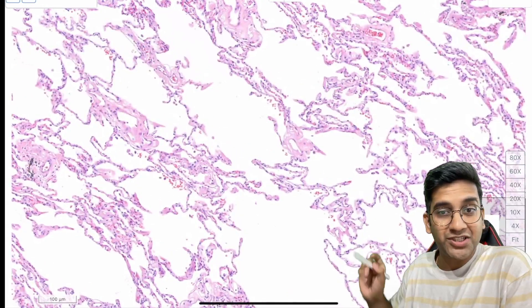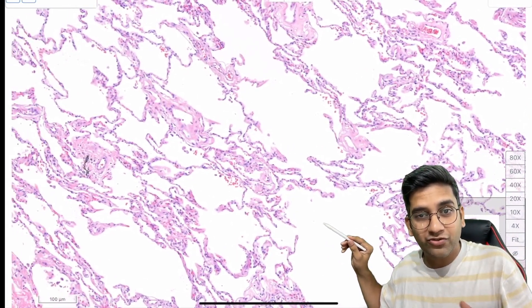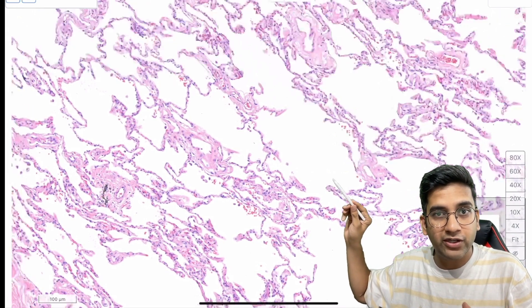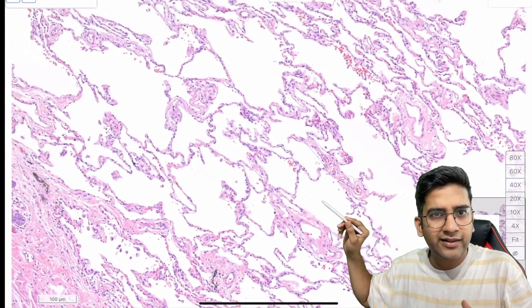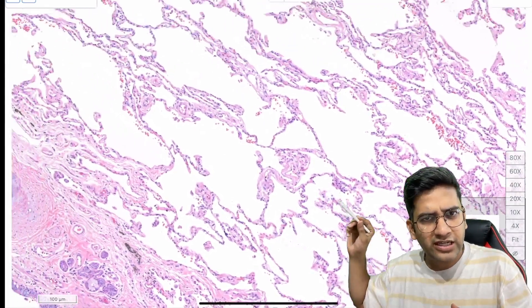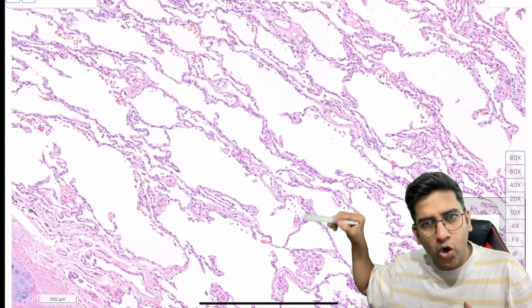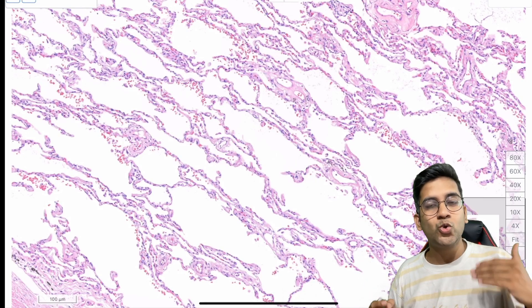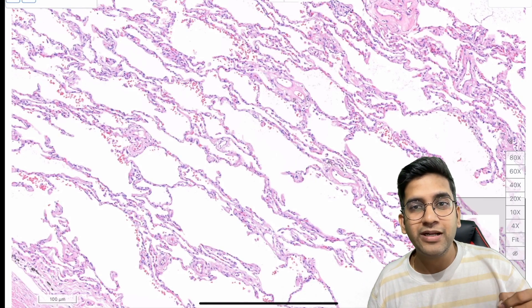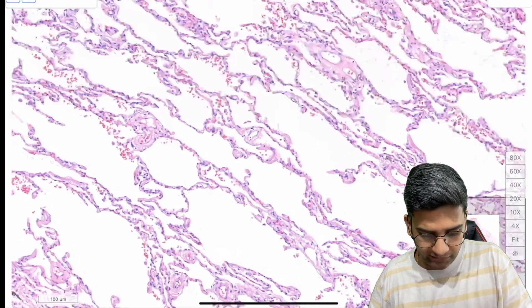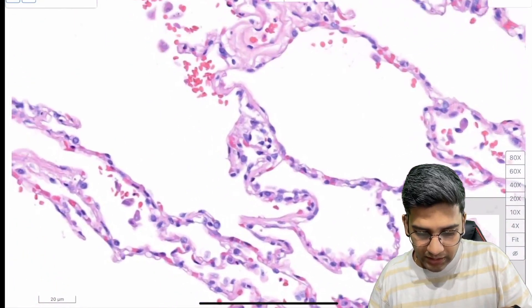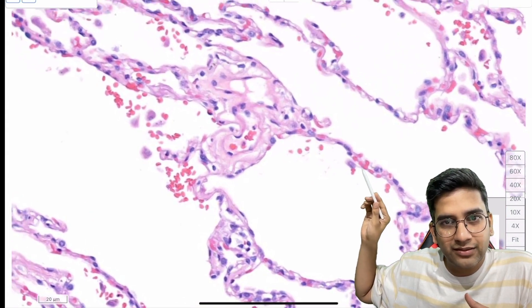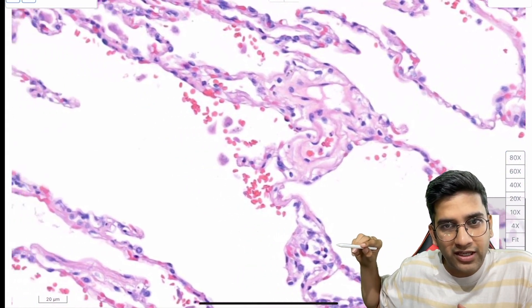Now for the alveoli on the slide. As I asked earlier — these are the pores of Kohn, connecting from one alveolus to another. They are not individual separate structures; they are definitely connected. You can see individual alveolar sacs adjacent to each other with no prominent interstitium in normal alveoli. Zooming in, you can see tiny capillaries in between — these are where the air-gas exchange happens.